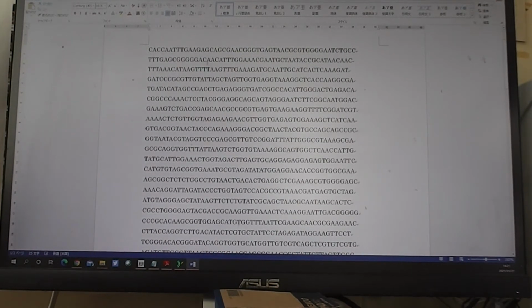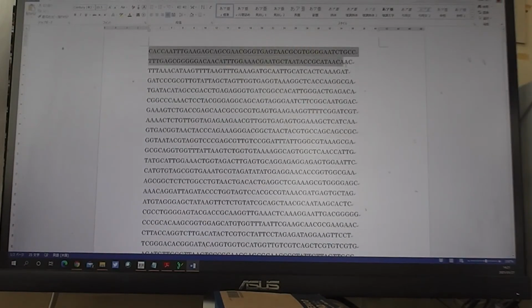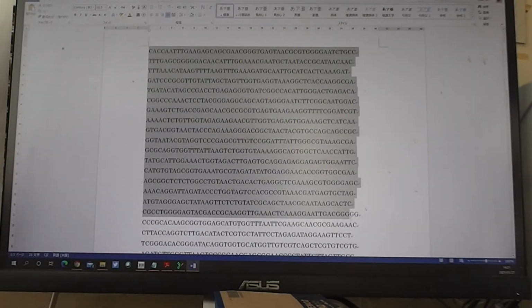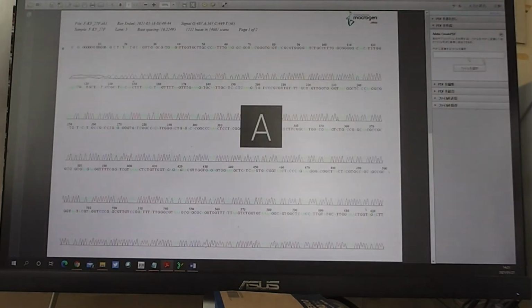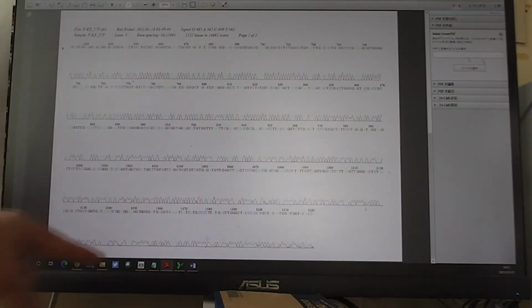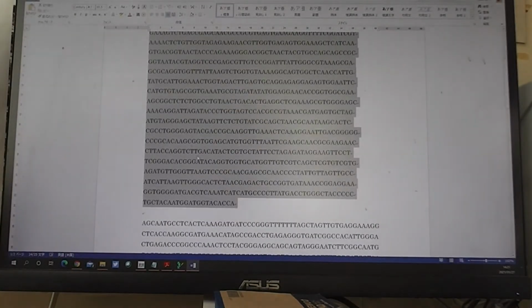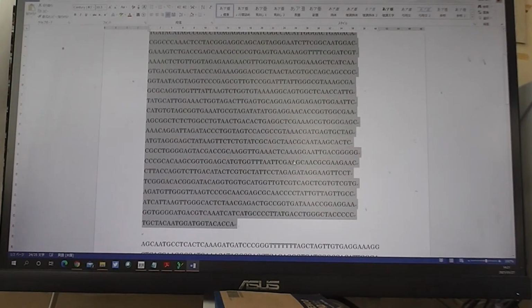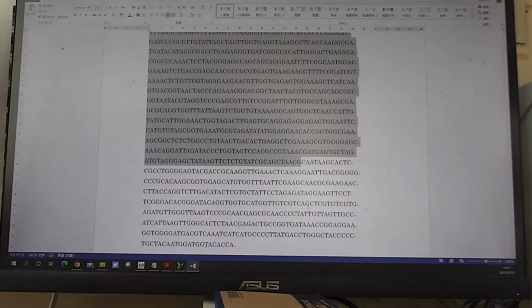Yeah, I cut off here. Okay, and so maybe good data, a very sharp peak around here. But as I said, at the end of the sequence, for example around here, not so good. I think this is just case by case, but approximately 70 to 80% from here, around here, the quality of the sequence is no problem.